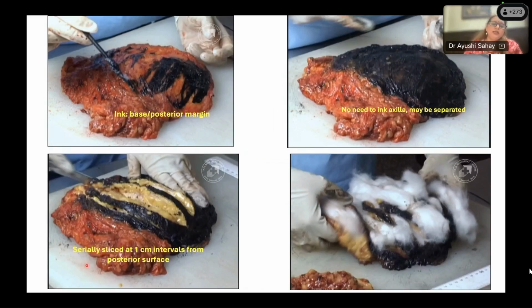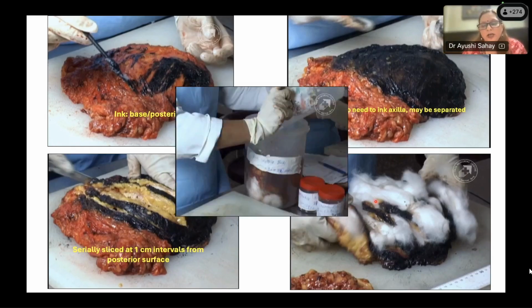And you have to serially slice a mastectomy at 1 centimeter intervals from the posterior surface. You need a very nice sharp knife to be able to do that. And you have to put cotton swabs dipped in formalin in between the slices, and then place the specimen in an adequate volume of fixative so that there is good fixation, and these cotton swabs will help the formalin to penetrate between the slices very well.